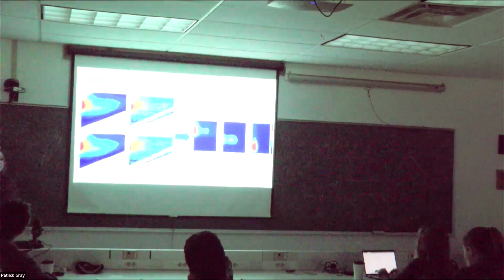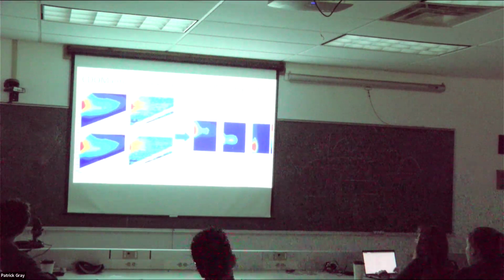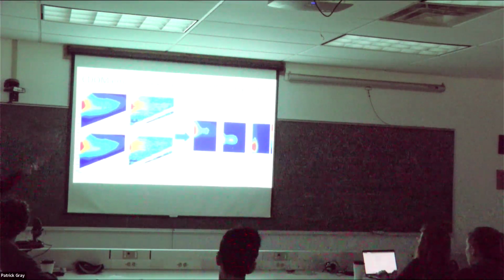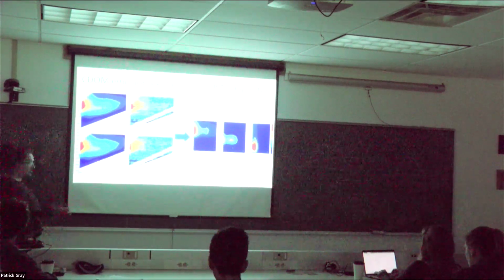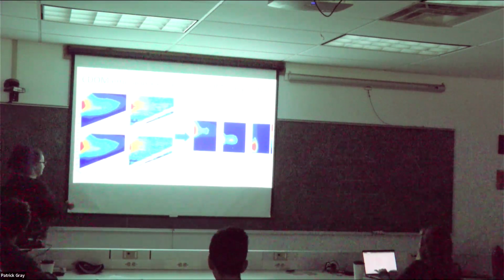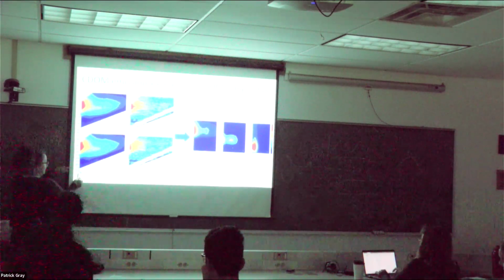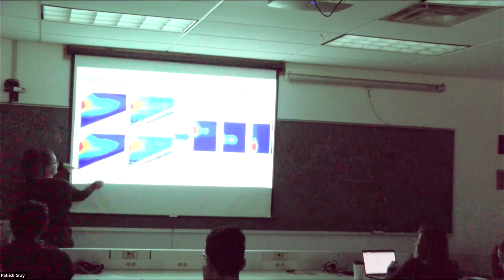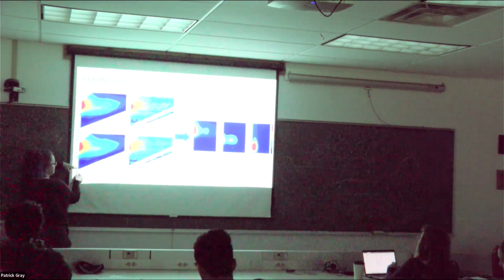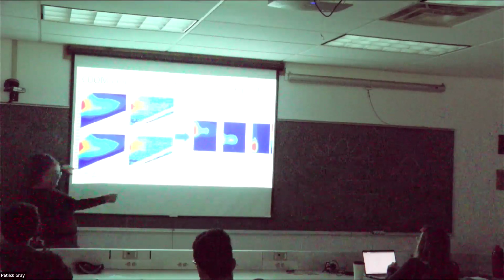If you want to be fancy, then you would do that emission excitation spectra. Okay? So what are they doing here? They're combining two things. Let's go back to what I was saying. Excitation. So you have a light, and your detector is at 275. Fluorescence cannot go right, it always goes to the left.